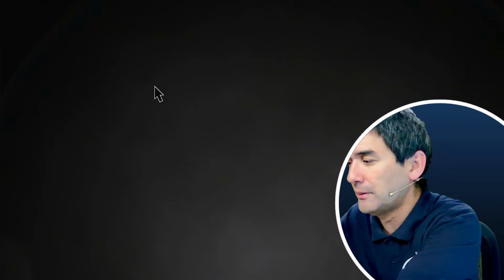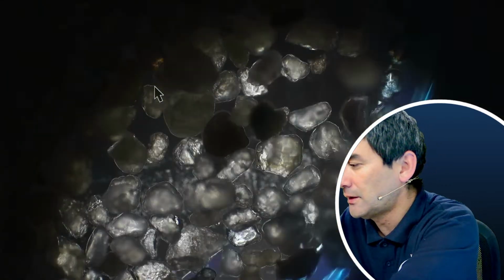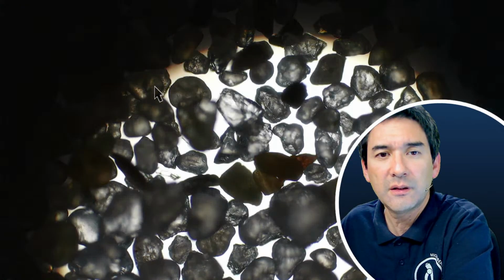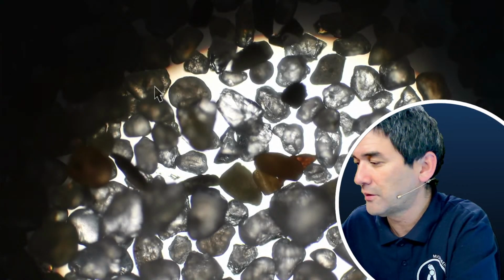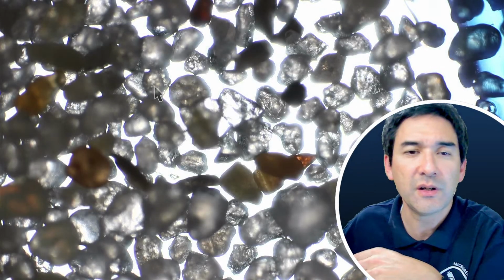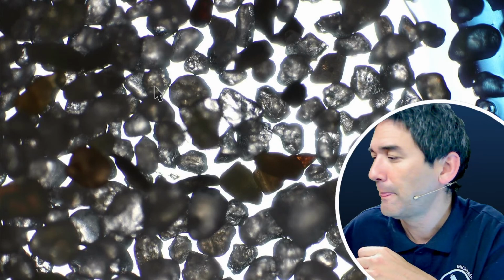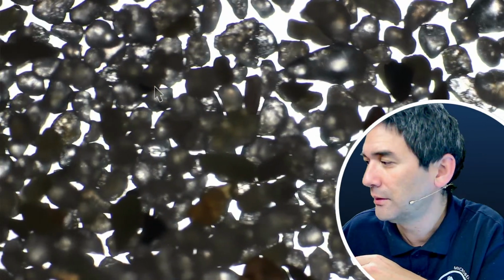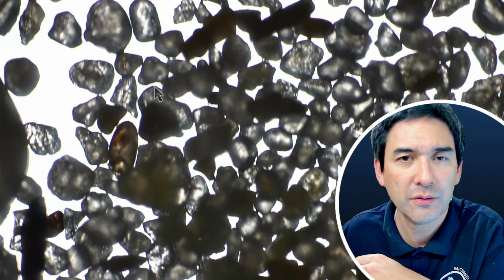Okay, where do we have the other one here? That's still a dark field. Let's do it like this. Again, let's flip out the condenser, and this is how it looks like under 4 times magnification.